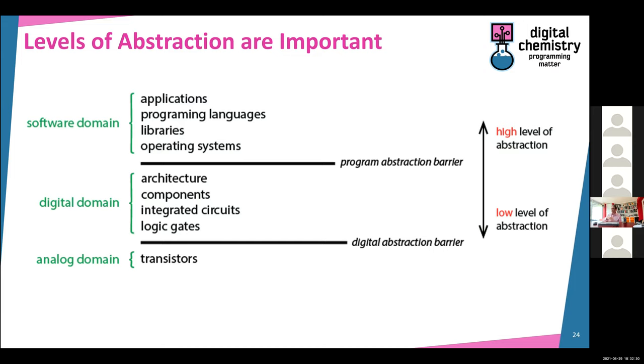So this is literally the million-dollar question. How can you start to design a state machine for chemistry that can link the dirty chemistry, the manual labor, to the high-level stuff?